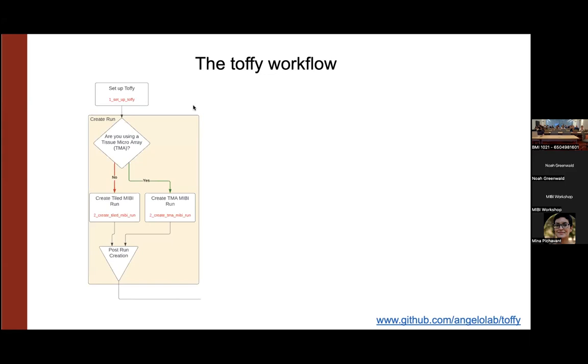If you are ready to acquire cohorts, that's great. The first step in the pipeline is how you want to set up your runs. Hadeesha alluded to this yesterday in his talk on acquiring FOVs for your cohort. There are basically 2 notebooks. One of them is designed for TMAs, and it'll guide you through some sanity checks to make sure that you named all your cores correctly and that they're in the right spot. Then it'll randomize the acquisition order so that there's no confounding between potential batch effects of the instrument and the way in which your TMA was laid out. The other notebook is for tiled runs. If you're going to stitch a bunch of images together to get something like a 1600 by 1600 or 3200 by 3200 image, that notebook will automate that process so you're not trying to piece together the jigsaw puzzle yourself.